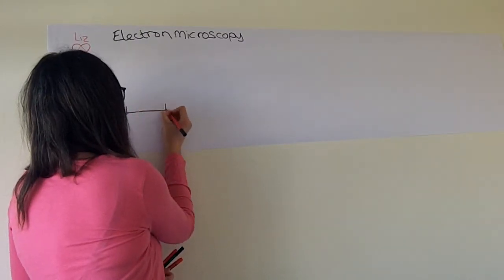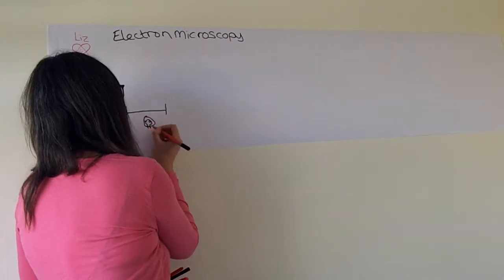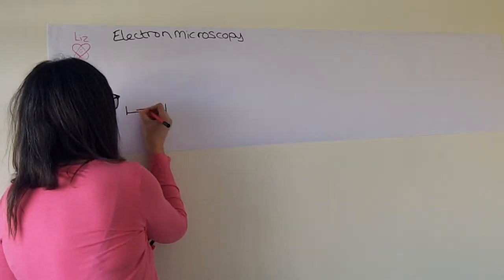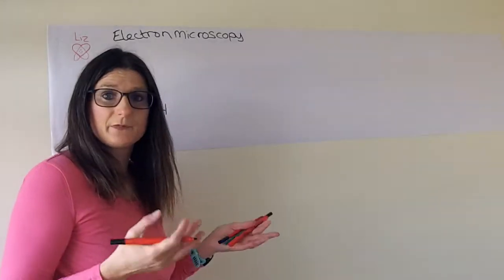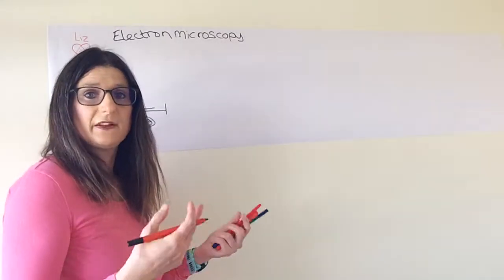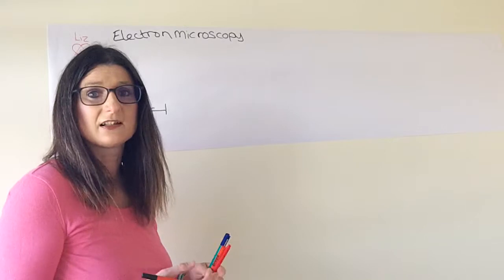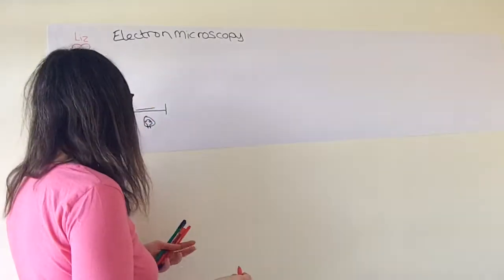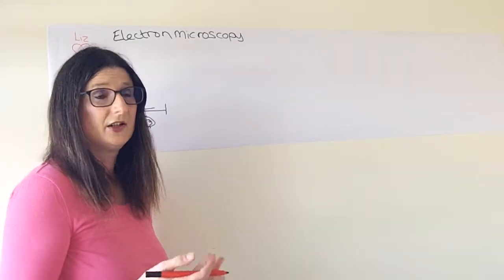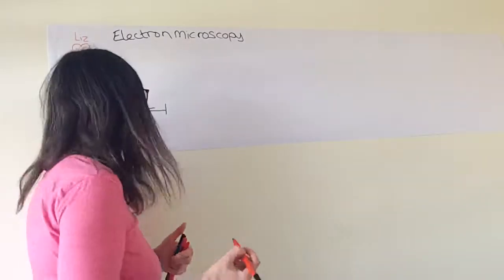Here we've got our sample stage and our light source here. Black's probably not the best colour for a light bulb, but never mind. And our sample's mounted on there. You can look at anything under a microscope, but if you want to look at plant cells, a good one to look at is onion skin or onion membranes, because they're really easy to get out of the onion and it's pretty much ready to go. You can stain it with a bit of iodine, which you may be able to get from a chemist or online, but that's pretty much all you have to do.